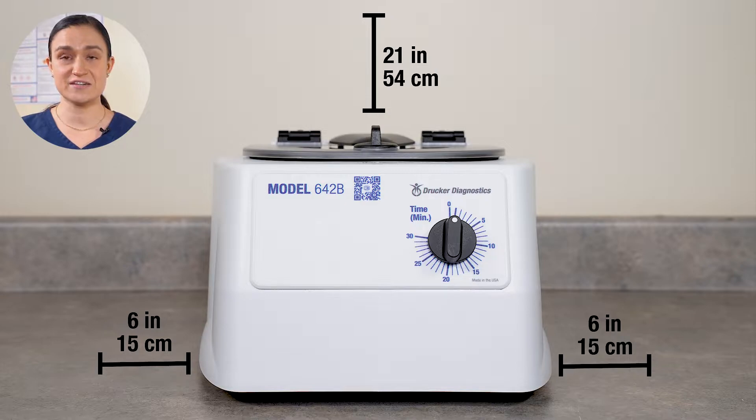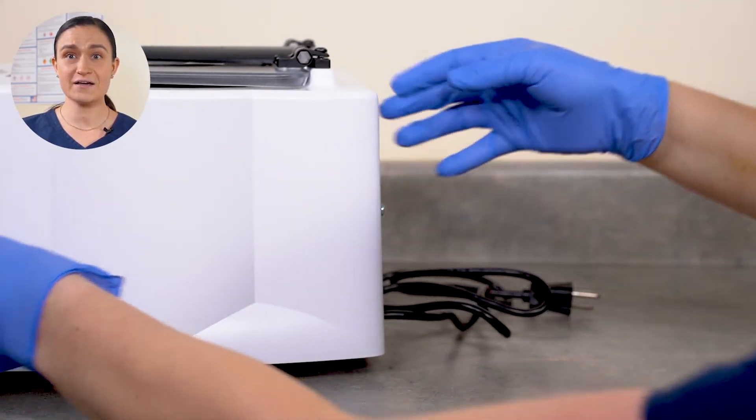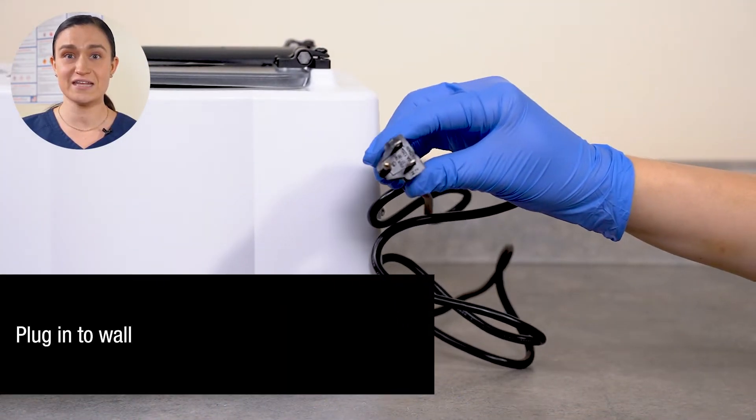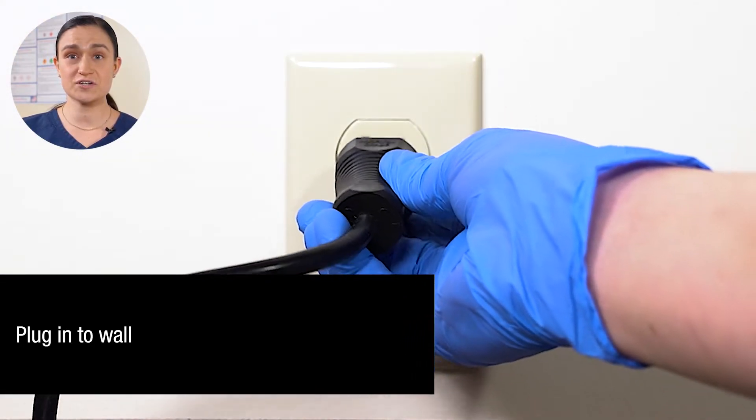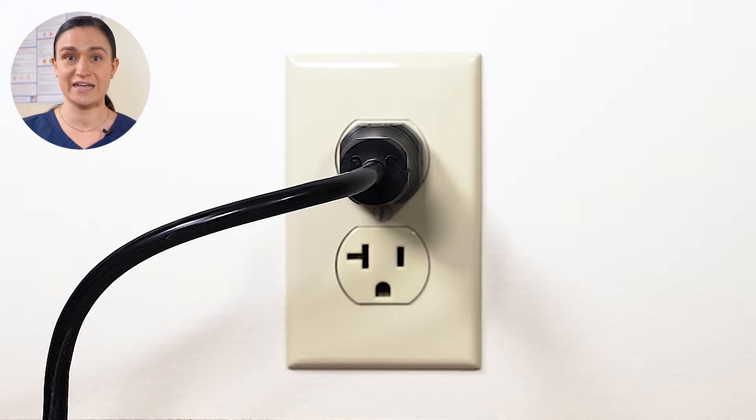Start by placing the centrifuge on a flat, level, sturdy surface. Leave at least 6 inches or 15 centimeters on all sides and at least 21 inches or 54 centimeters of height above the lid so you can easily open it. Locate the power cord on the back of your 642B and plug it into the wall. Make sure your outlet is easily accessible so you can unplug your centrifuge for cleaning and maintenance.